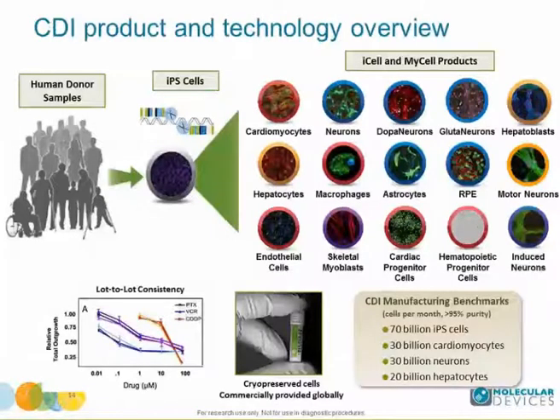We talked a little bit about cancer cells and doing those in cancer cells, but if you're not doing cancer biology and you want to move into a more biologically relevant system, and you want to do this in a sort of human environment, iPSC-derived cell lines are a nice technology.